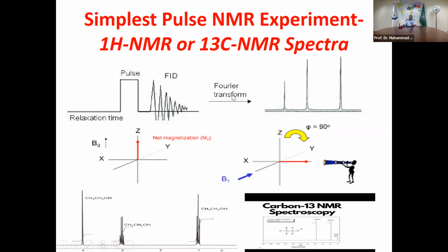You do a Fourier transformation, you get 3 signals. Okay. Then you wait for a while. It's called relaxation time. Sometimes it's called preparation time. Then this is excitation, this is detection. So preparation means you're preparing.